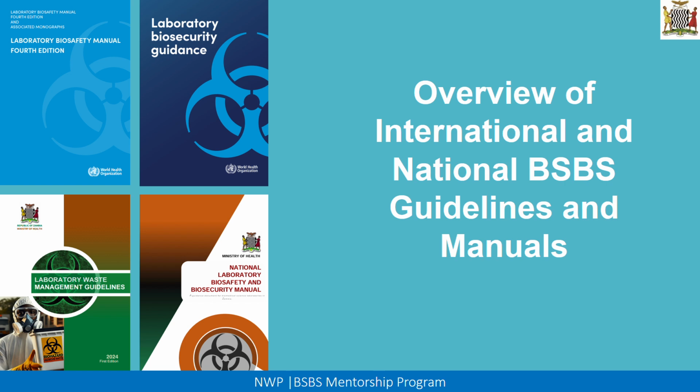So in this session, we'll look at an overview of the international, the national, as well as some local biosafety and biosecurity guidelines, as well as the manuals. Under the international, we'll look at the Laboratory Biosafety Manual. We'll look at an overview of the Laboratory Biosafety Manual. Then after that, we're going to look at the biosecurity guidance.